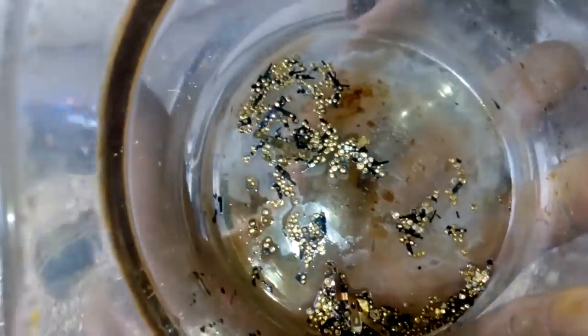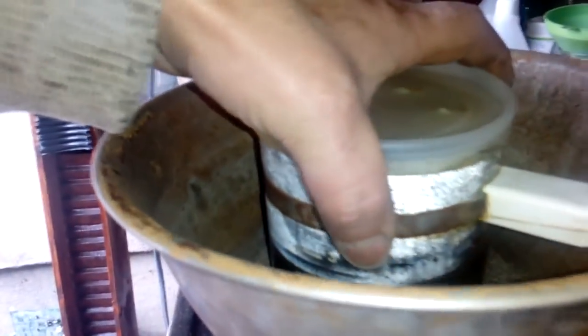In Aqua Regia. We just started — we got a lot of gold to dissolve. You see that? See those bubbles? And we got a very positive Stannous test. Great.